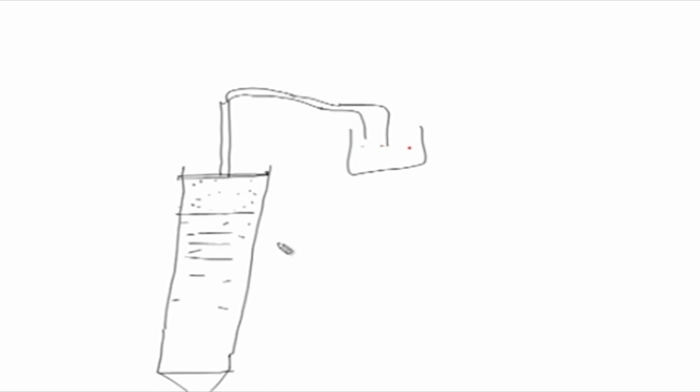So, you have the stationary phase filled in here, and you have your mobile phase here, and you will have closed it with a plunger or with a cork with tubing in it. So, there will be tubing attached to your mobile phase. It may be through a pump or it may be without a pump, so you can do it either by gravity or without gravity.